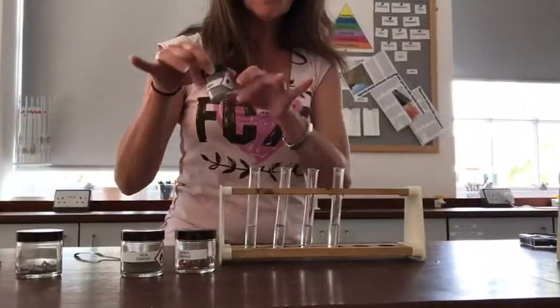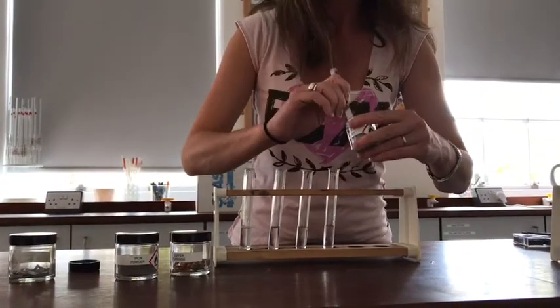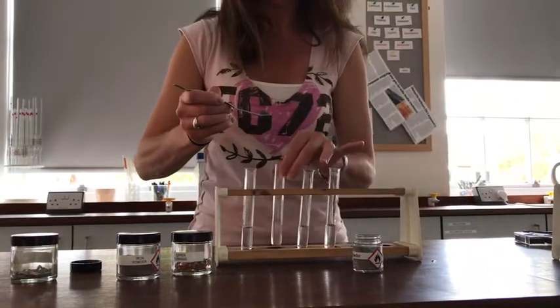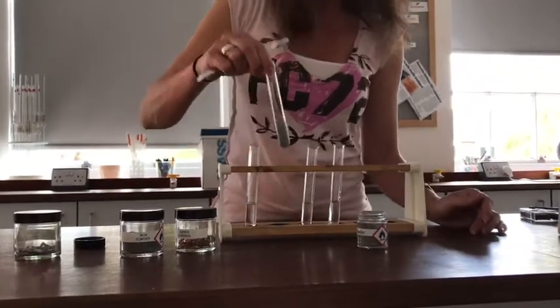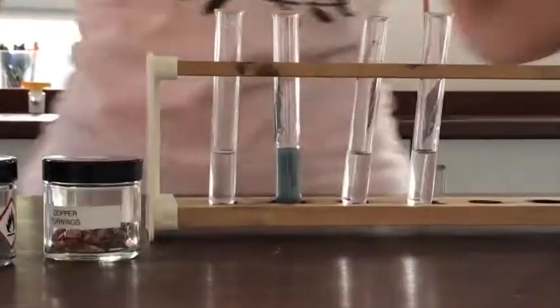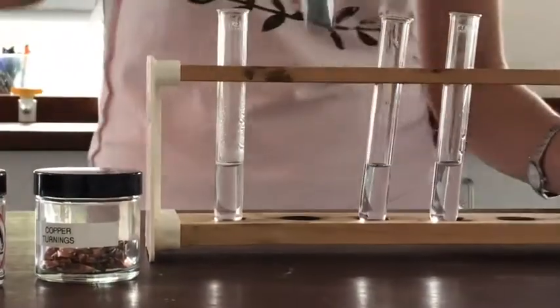I'm going to carry on now adding metals to the remaining tubes. This one is zinc powder, so I'm going to put a little bit of this in with my acid in the tube. You can see it's immediately not such a vigorous reaction as I got with my magnesium.